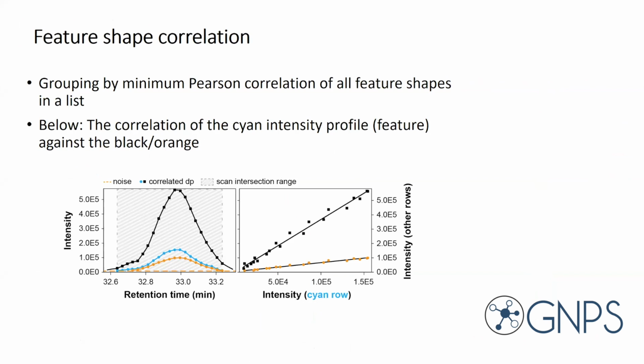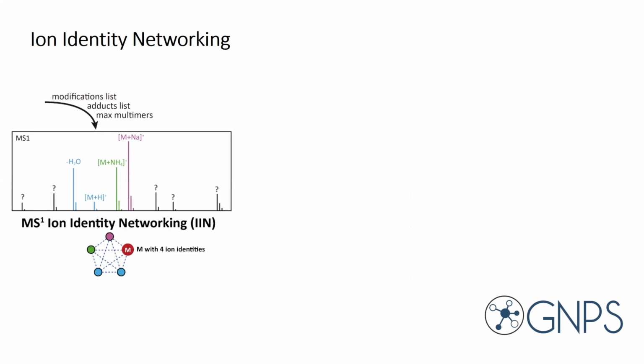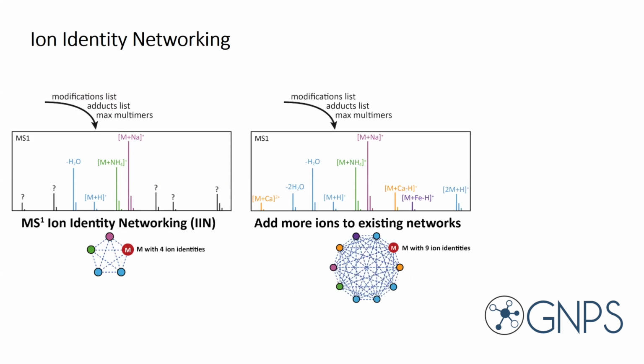That's actually something which has been done for a long time on a very manual level. It's a very typical thing for analytical chemists to do, investigating your data to see whether an adduct has the same peak shape. Based on this user-defined mass list, that allows us to identify the different adducts. And not only adducts, we can also look for neutral losses, there was actually a question about that, and for potential in-source fragments. The advantage here is that this is done in a systematic fashion within our workflow.